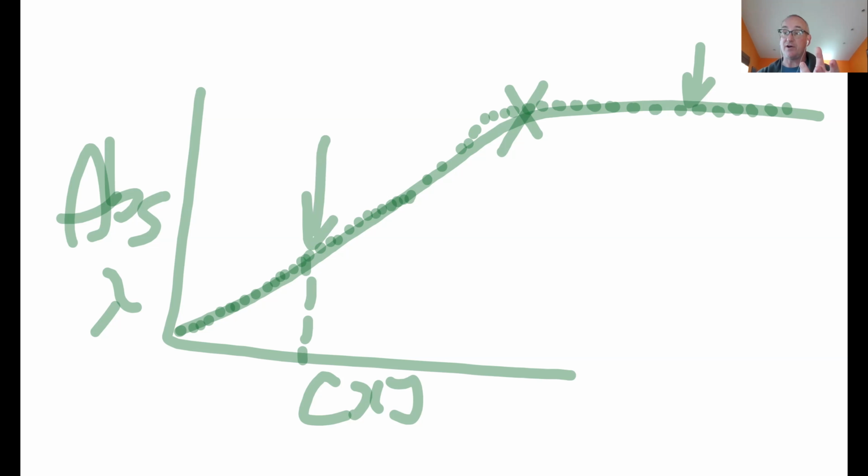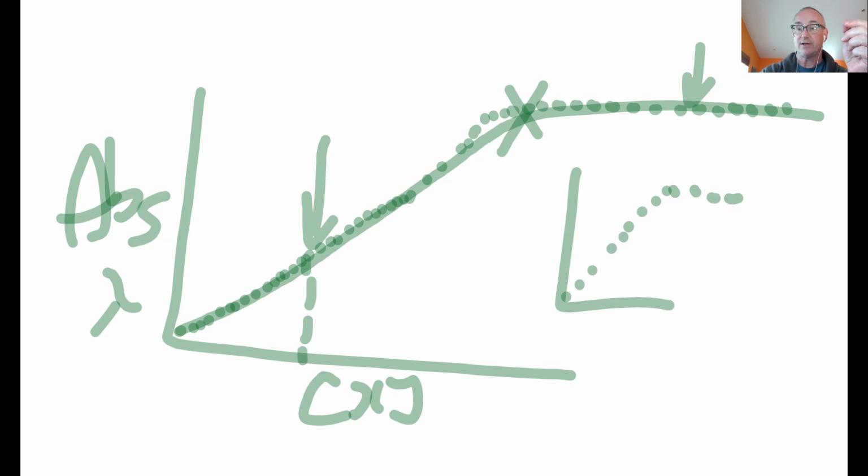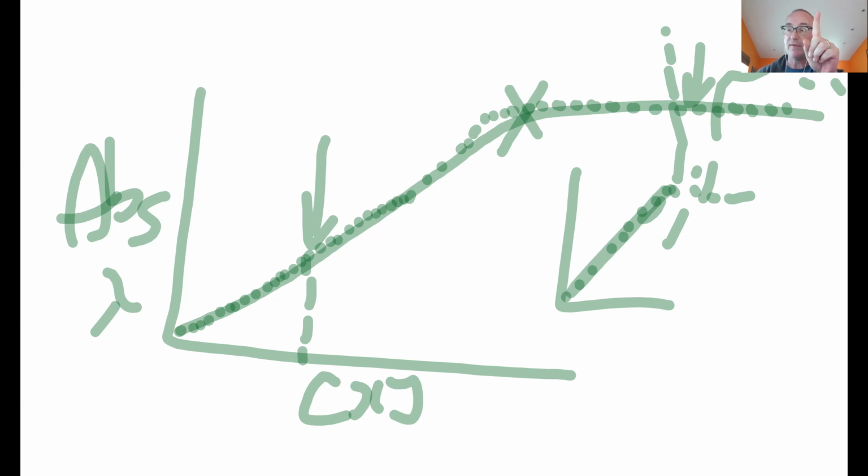But when you make a standard curve, you can't guarantee that it's going to be linear outside of the points that you measured yourself. You can't guarantee that. So it could go like this, like this, or like that. You don't know. So basically all you can guarantee is inside the measurements you did yourself. If it's outside of that, you can't use it. But as someone suggested, you could make more standards to extend that further. In fact, that would be the thing to do. So that's why I suggest going outside of the concentration slightly.